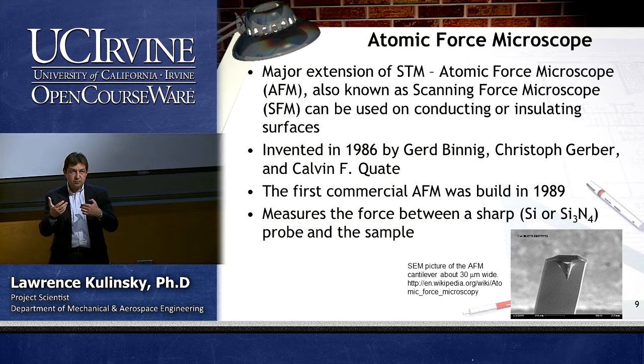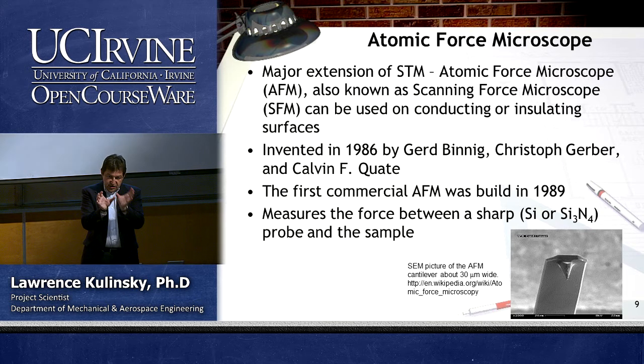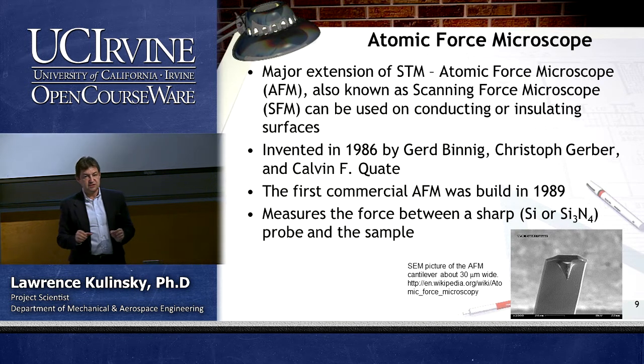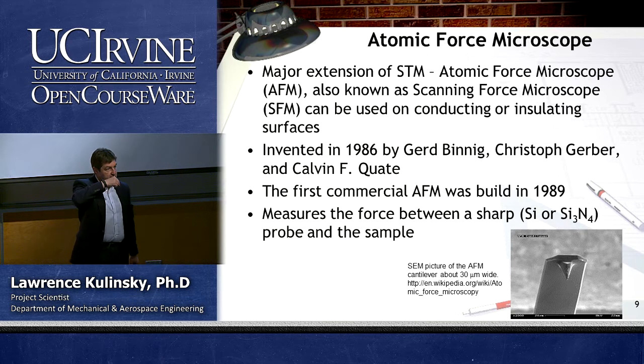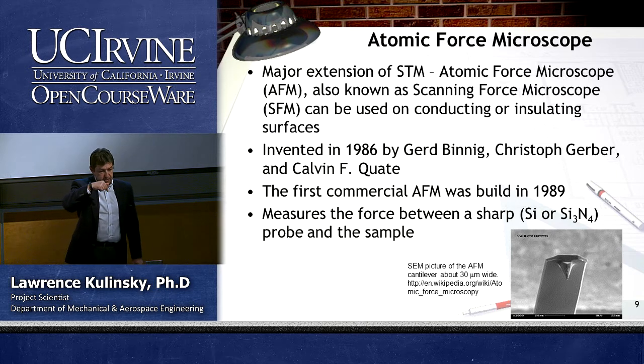If you have two molecules, they are polarizing each other, and you have this basically electrical force, which is the van der Waals force. But for AFM, the main force would be capillary force between the tip and the surface. And it basically goes and drags a pool of liquid around.